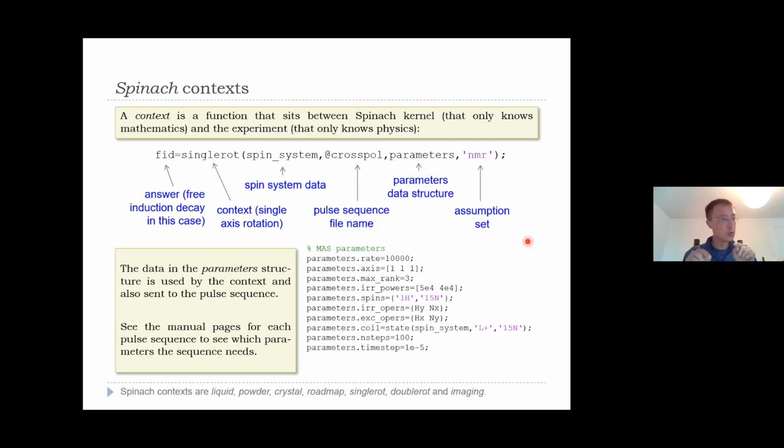And those tutorials that I've linked, the Dropbox link, they contain a step-by-step walkthrough of solid-state NMR simulations of this kind. And then a few other things. Of course, the coil: in an NMR instrument, you would actually have a coax cable that you would click in somewhere.